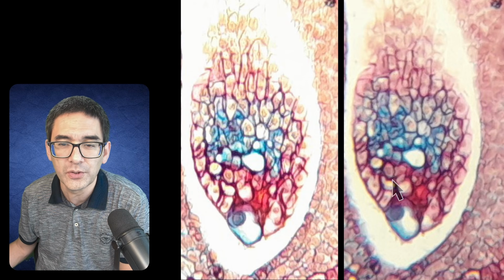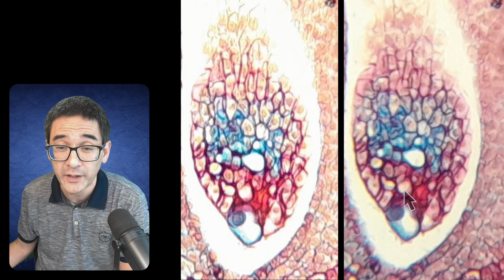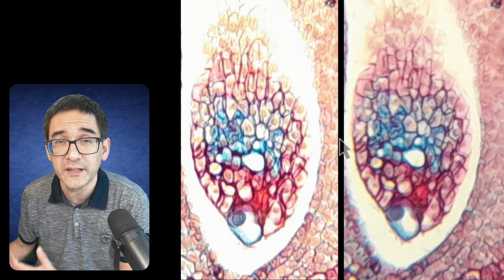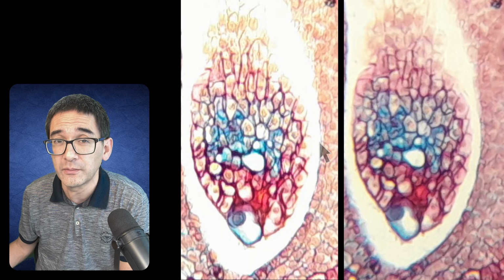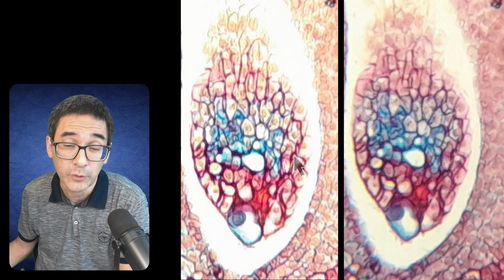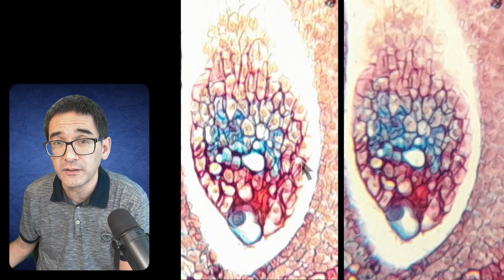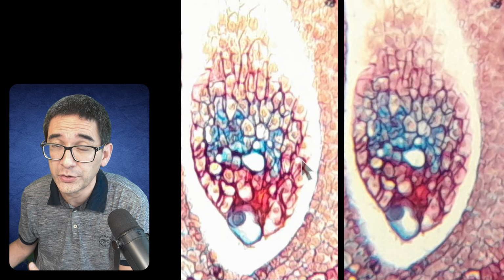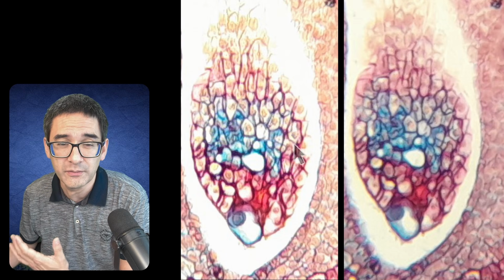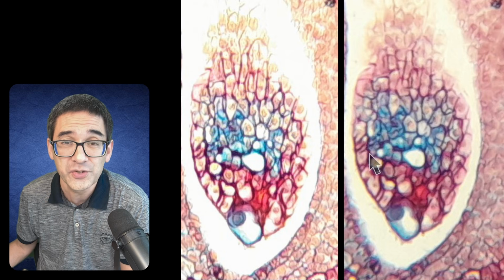Not surprising, because the objective itself did not have the numerical aperture, right? It's the 4 times objective, simply enlarged. So you do not really see that so much when you're just looking through it under the microscope, at least not at such a comparatively low magnification, but there is a difference, right? And for this reason, you do not really gain a lot more by just increasing the eyepiece magnification, because you're constrained by the physical laws of light, so to say, right?